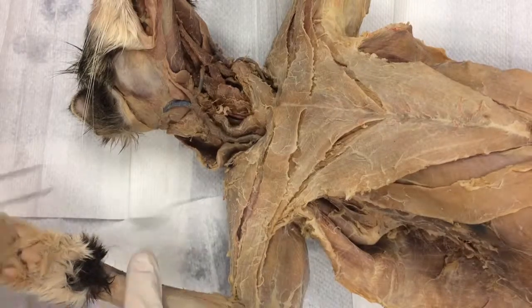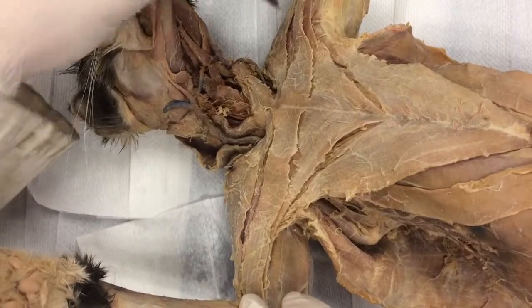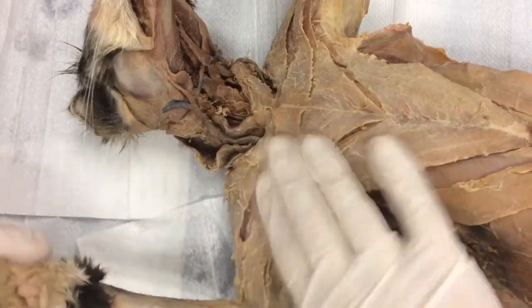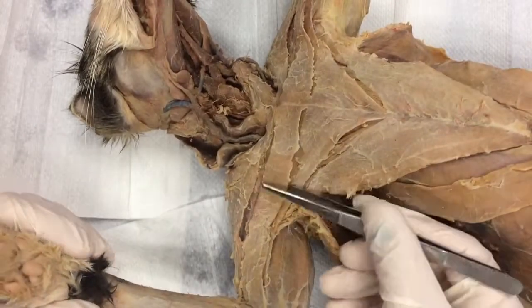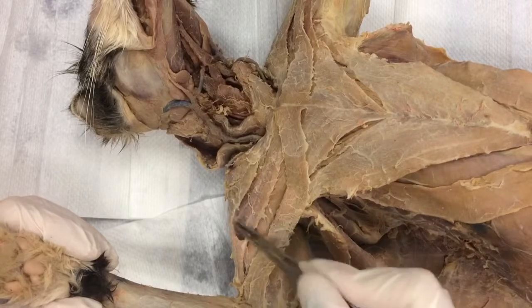Before we can do deep chest, we have to dissect one shoulder muscle right here. It's called clavobrachialis — its other name is clavodeltoid. And if you did pectoantebrachialis, the line should be incredibly obvious.